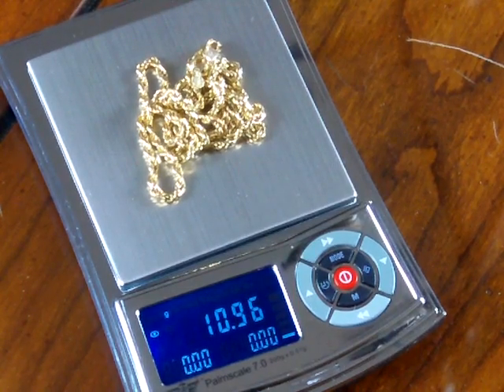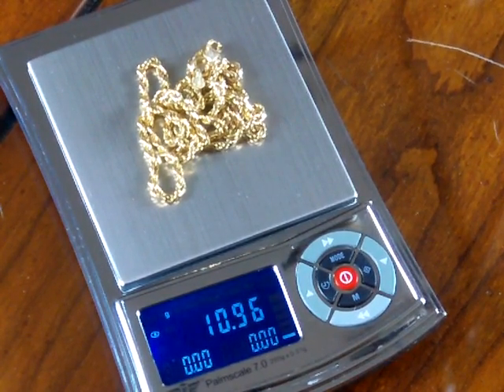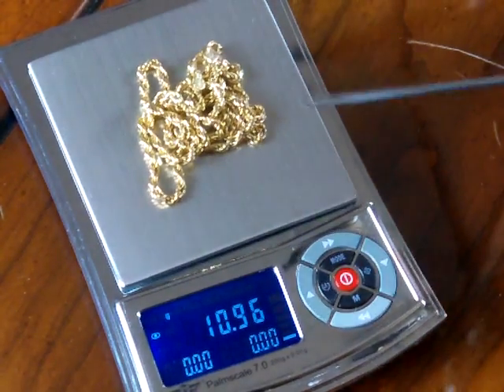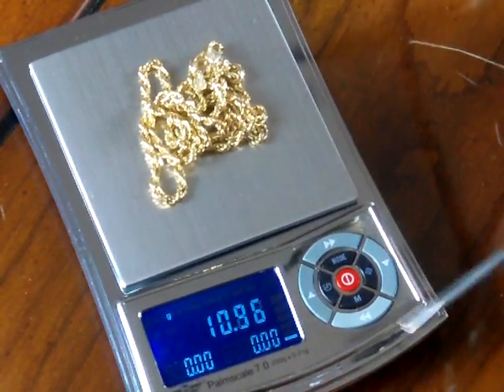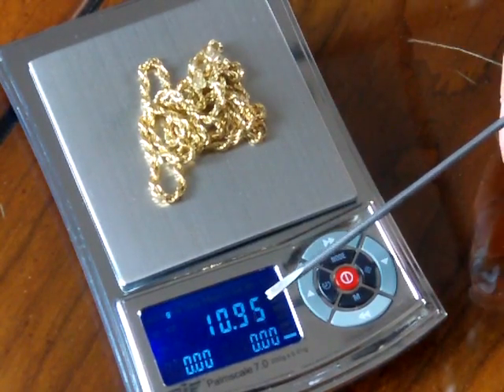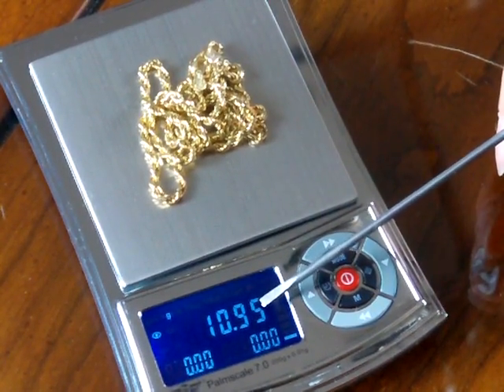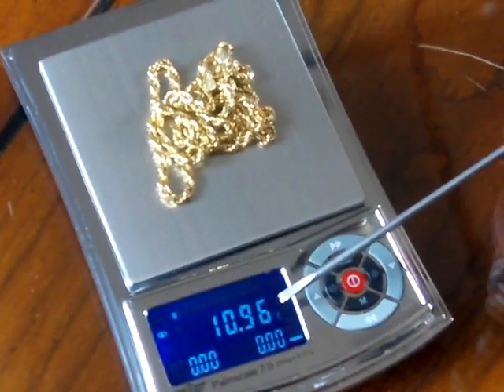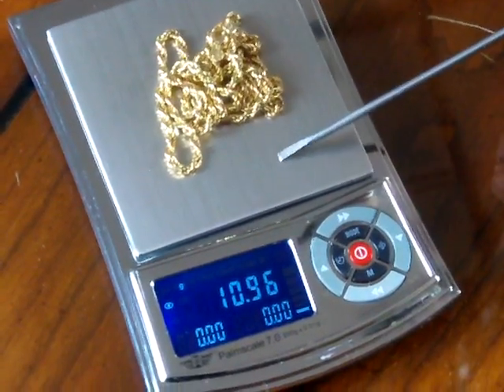Today we're going to be showing you the My Weigh Palmscale 7.0, and this is the 200 gram version. This scale has a weighing capacity of 200 grams and it goes to two decimal places — so .01. You'll see the scale increment goes .01, .02, .03.